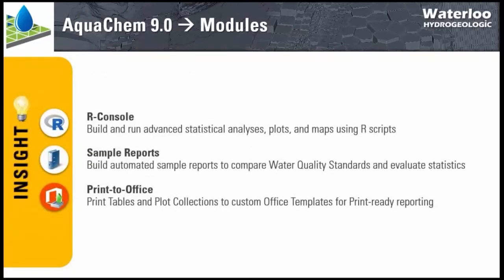In terms of insight, we have a newly built R console that allows you to build and run advanced statistical analyses and other analyses using R scripts. I'll show you some examples of that as well. Build sample reports to pivot your data and compare your results to water quality standards or evaluate generalized statistics.